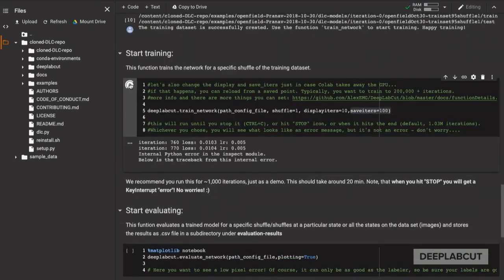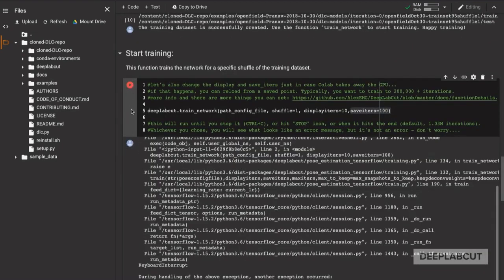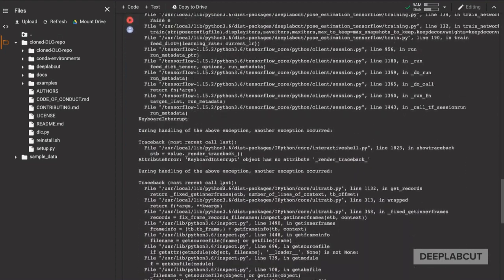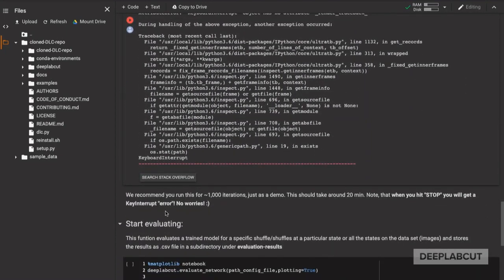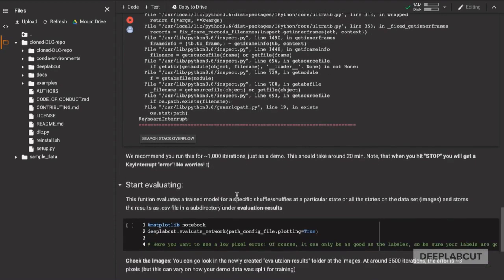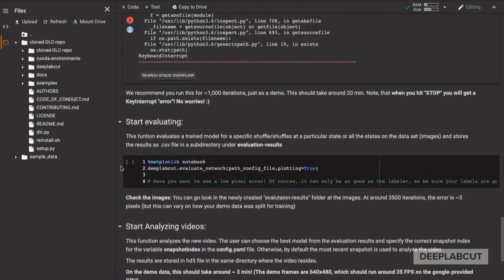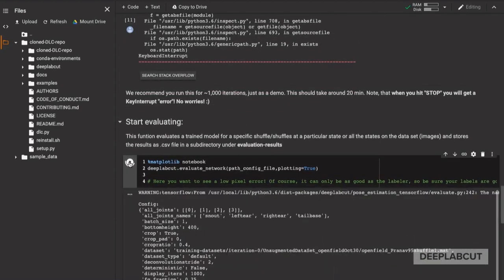When you hit stop on this cell, you're going to see some errors, but these are not a problem. Don't worry, keep on going. We can start now evaluating this network and see how the performance looks.